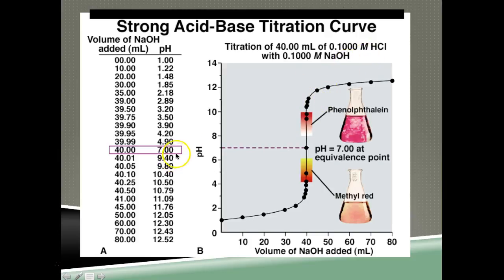The other thing is, you will see initially the pH is kind of holding steady. It's gradually increasing, but then there's a sharp rise when you get to the end point, and after that it gradually, slowly increases, showing that it's getting more and more basic.